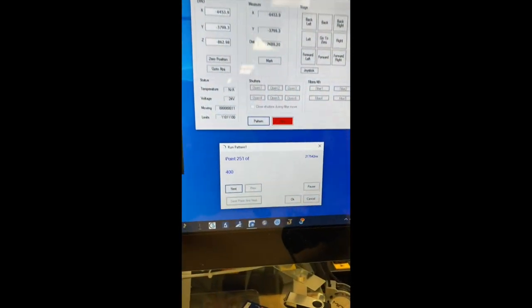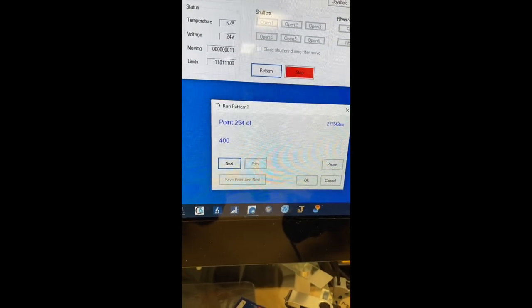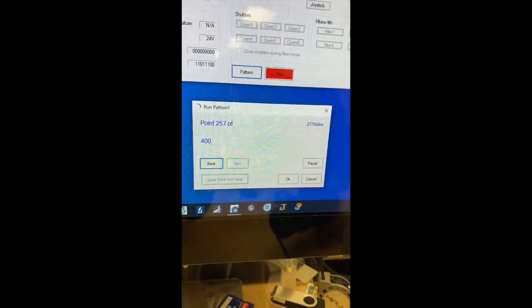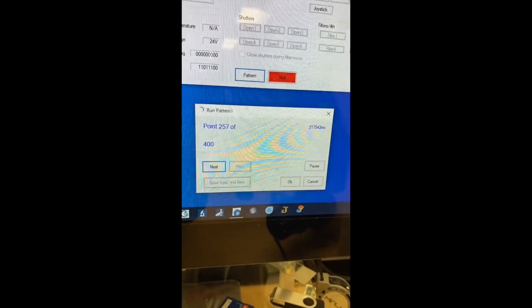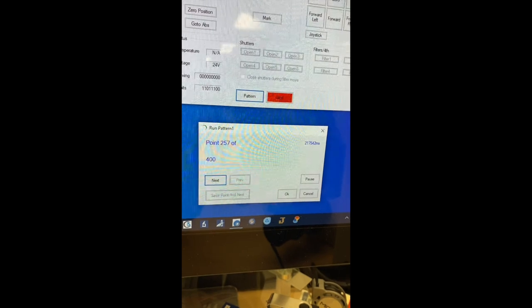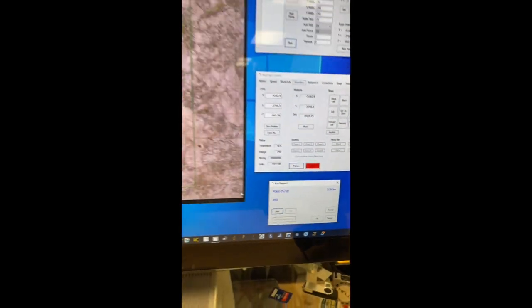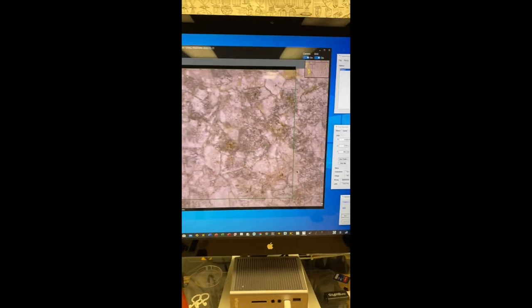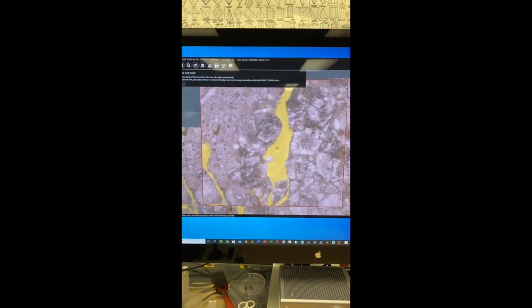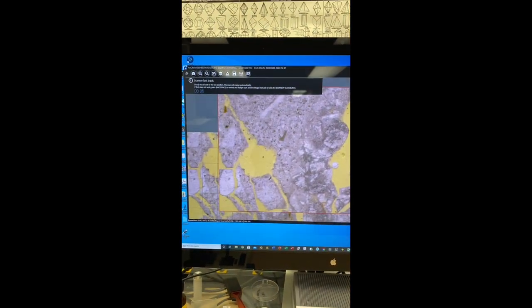It's showing how many points it has done so far out of 400 points, and when 400 points are done it will go back to the original starting point.